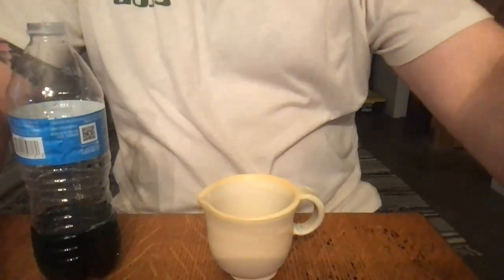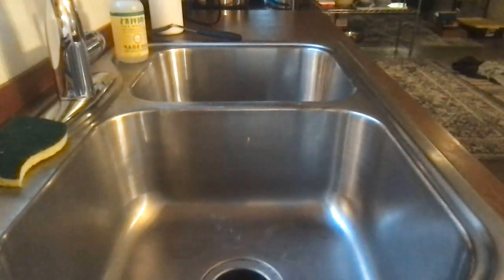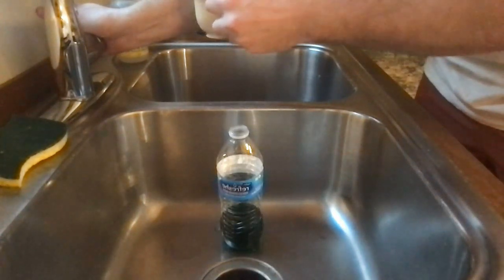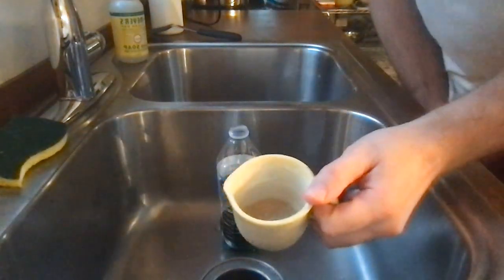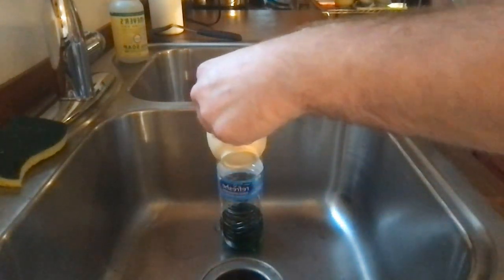So we're just going to go over to the sink here, and I'll add some water to the yeast, and hopefully we have a good reaction here. I haven't had very good luck this semester. Okay, let's see. Yeah, we can see. Okay, so we're going to go ahead and add our bottle here. So you can see we've got the yeast in the water here, and we're just going to pour it in.